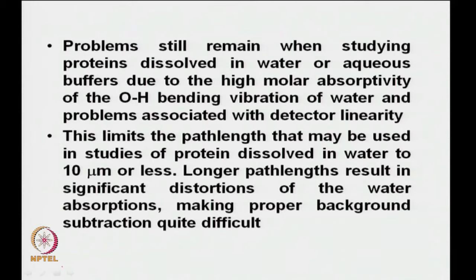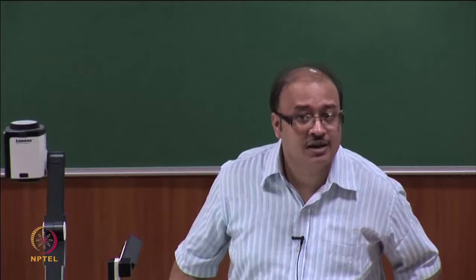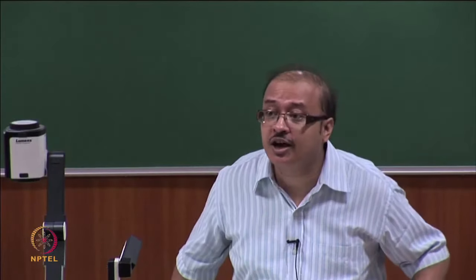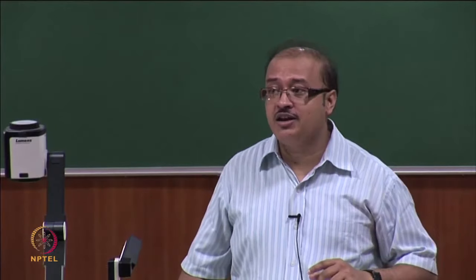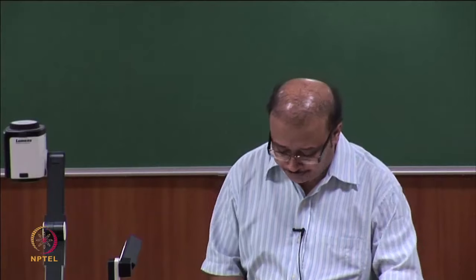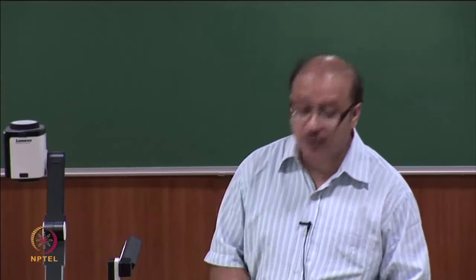So, as you can see, if you are going to use protein in water, you make sure that the path length is really small and the protein concentration is high, because only if the protein concentration is high would the amide 1 band have a huge amount of protein contribution. Now, let us look at it a little more deeply. Now, obviously, what is the remedy?